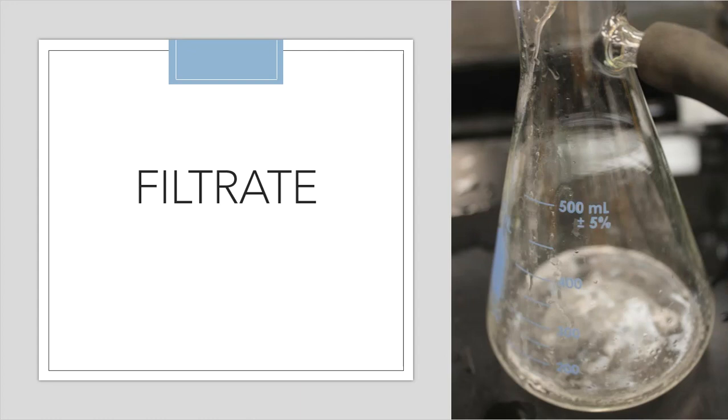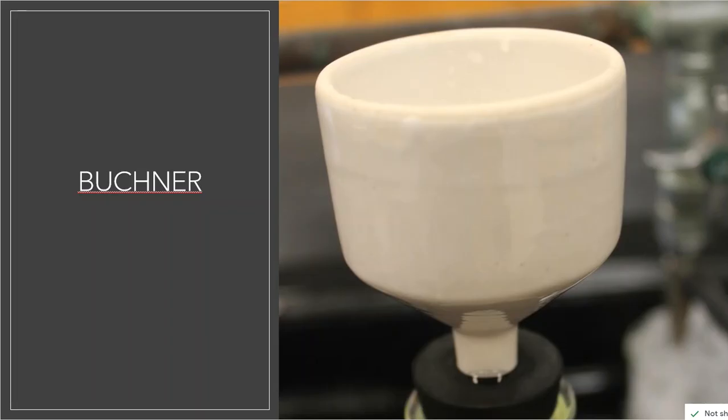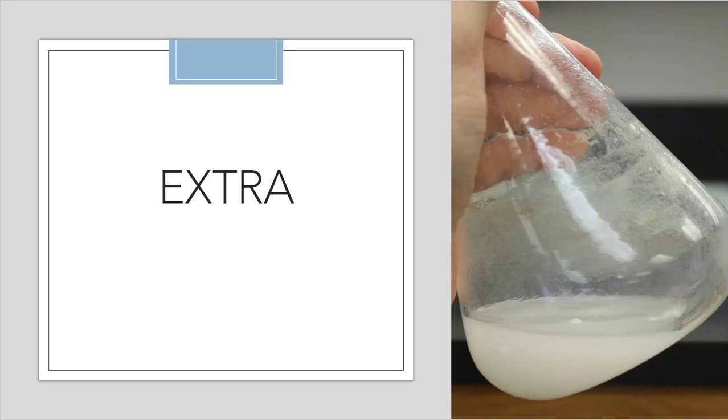So, at this point, what I have decided to do is take my filter flask away and exchange it for a new one. I need to re-pour all of that solution back through my filter paper because I formed product that's down there in the very bottom. All right, so Buchner funnel back on. I'm using the same filter paper. My product is still up there at the top. The only thing that I did was take off that filter flask that sits down below that had this soup of cold solvent with more crystals. And I just re-poured that through the filter paper.